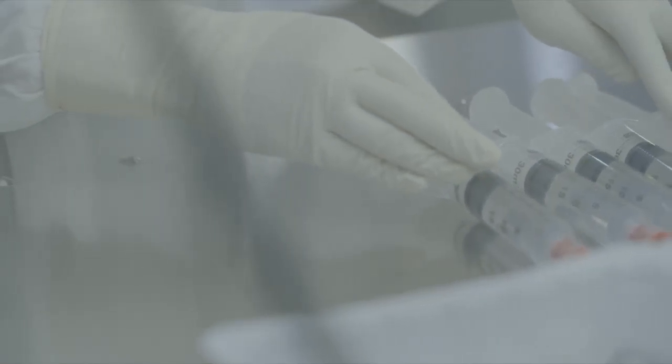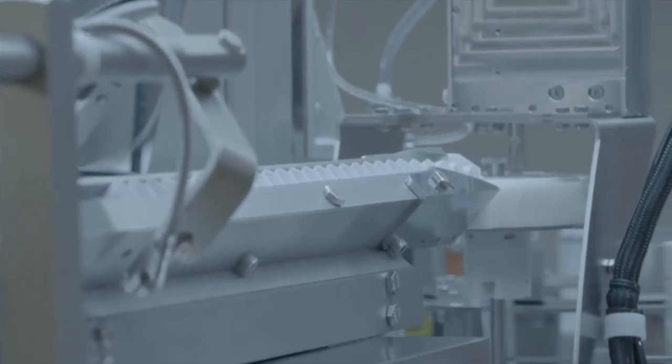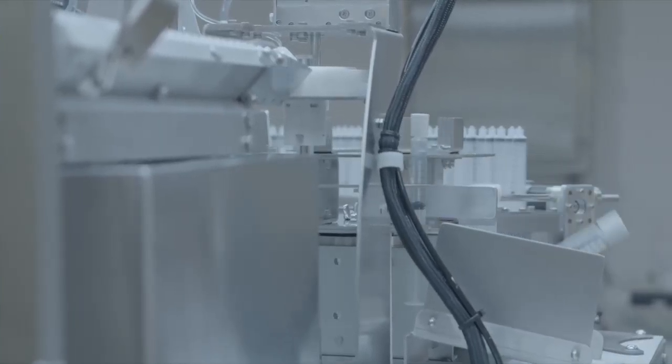Within these walls, we combine state-of-the-art robotics technology with highly trained pharmacists and rigorous testing procedures. We maintain two clean rooms, located in Texas and Arizona, which means that you won't have disruption in your supply chain.